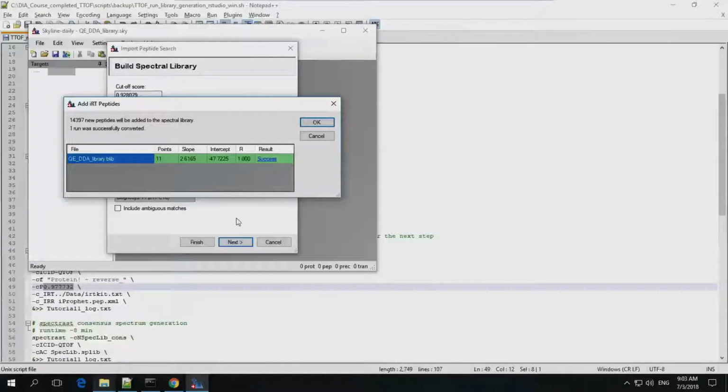Well, this is a result of that plot where they were going all like this. I decided that doing iRTs based on the 10 or 11 iRT peptides wasn't stable enough to build a library. So we now do internal alignment of all the runs to as many peptides as they share. So that's one of the improvements that we did that I think gives us better iRTs out of DDA spectra.